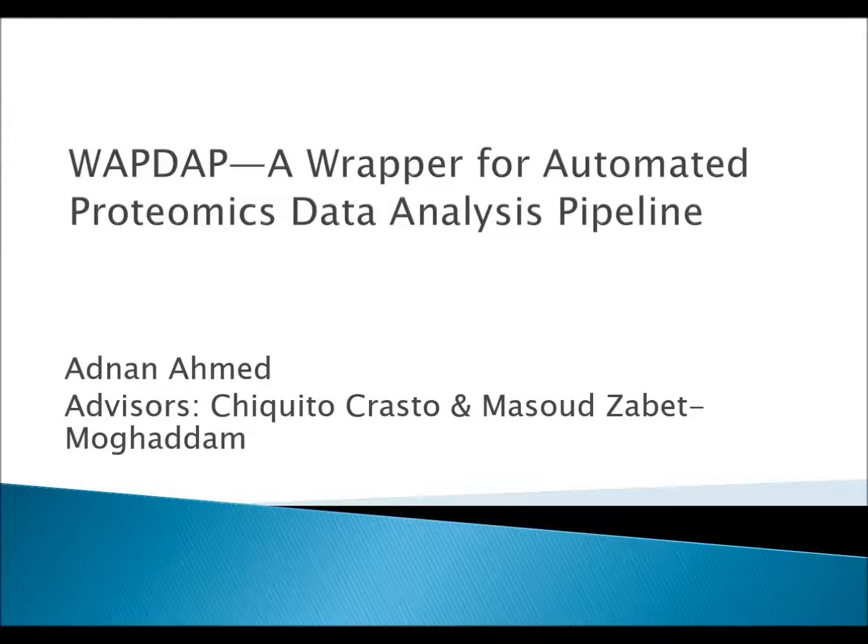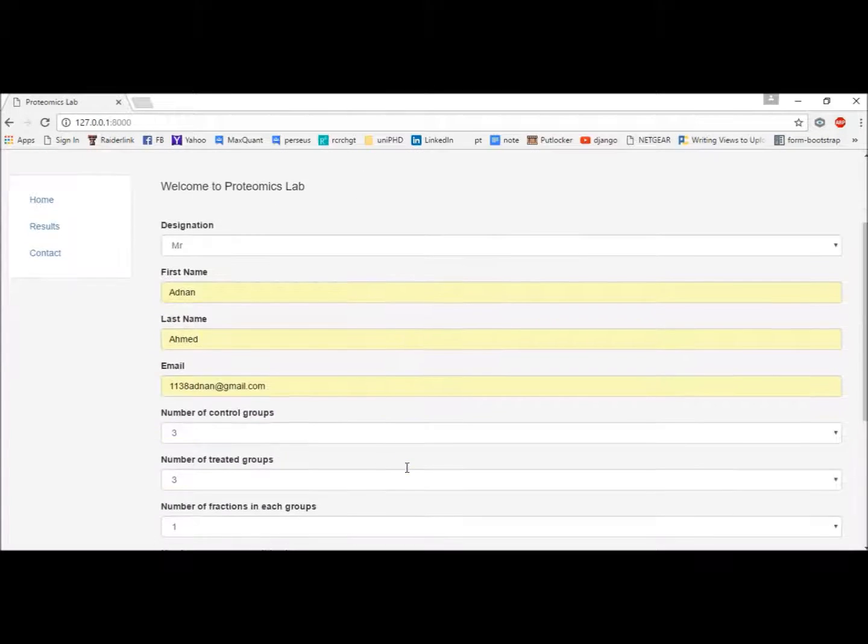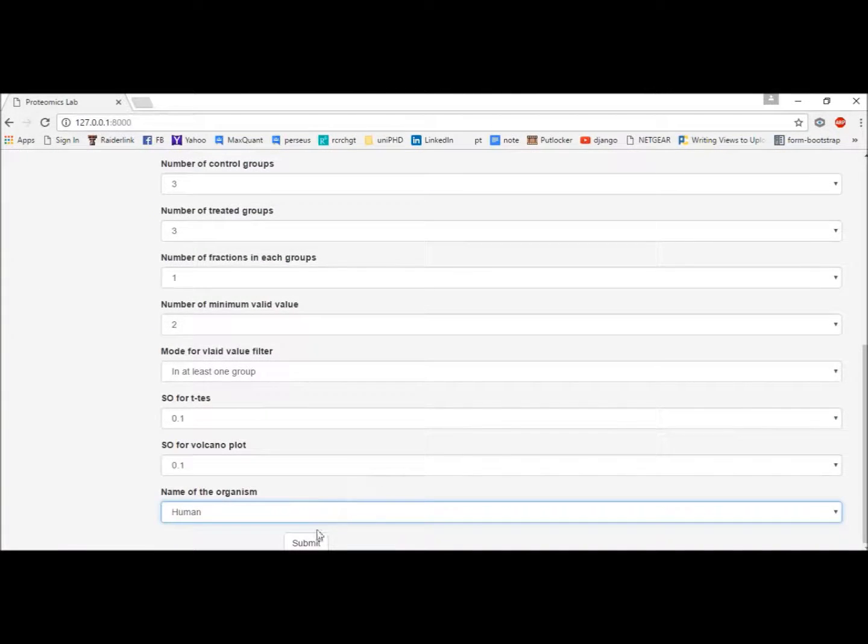In this video, I am going to give you a demo about the software that we have made named Wapdap, which stands for wrapper for automated proteomics data analysis pipeline. To use this software through the web user interface, you have to first open the website, then fill out the form and hit the submit button.